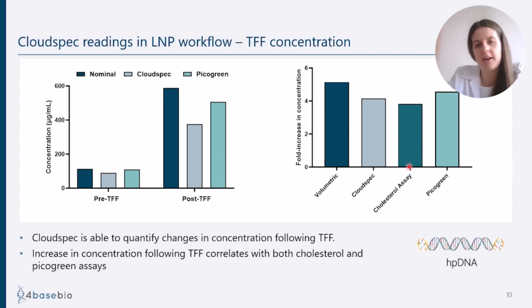And on the right-hand side here, you can also see a cholesterol assay for this particular formulation. So that's another method for detecting the cholesterol within the formulation. And I've just presented that as the fold increase in concentration of the formulation. Obviously, they're different components. But you can see that fold increase with the cholesterol assay correlates very well with the CloudSpec, and in this case also the PicoGreen.